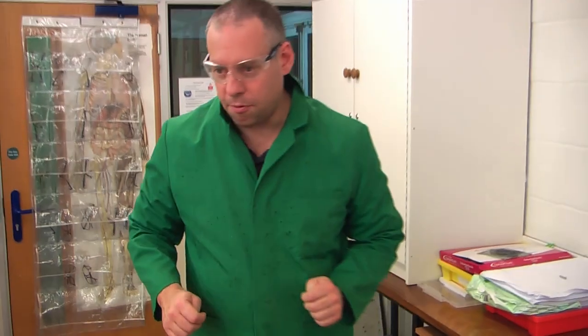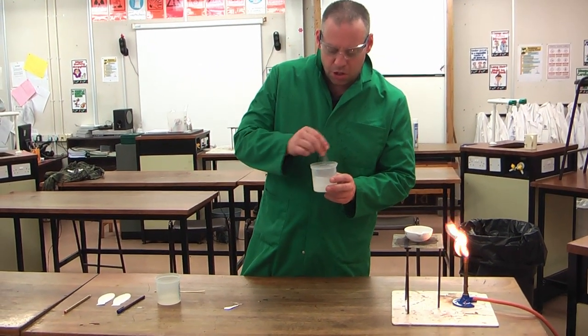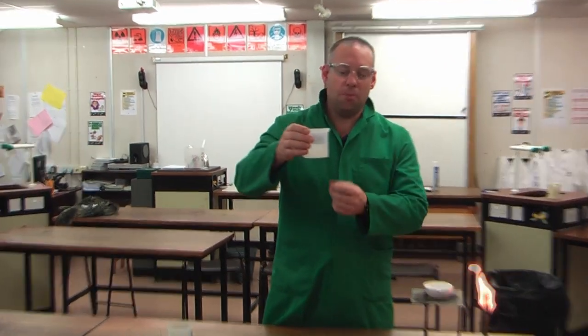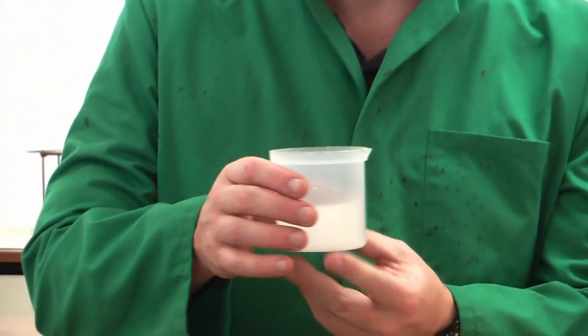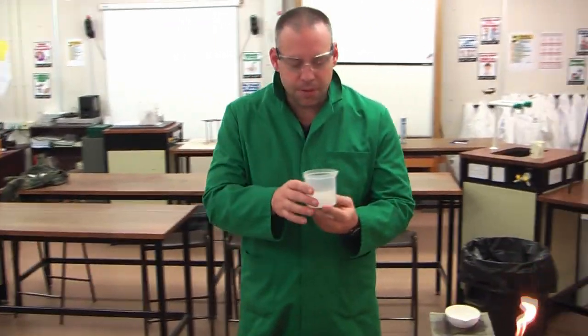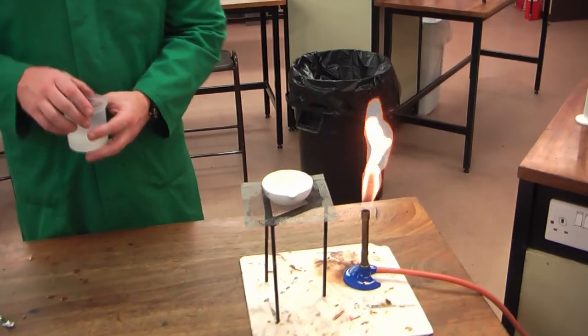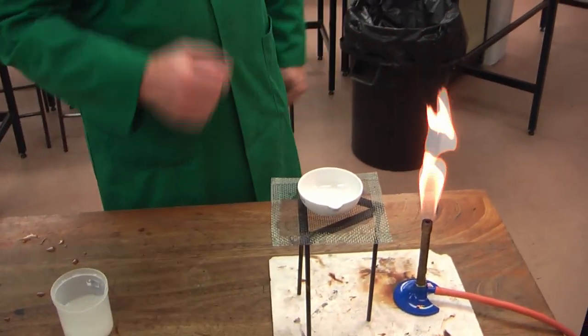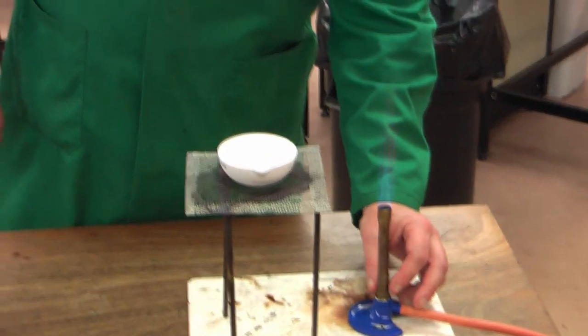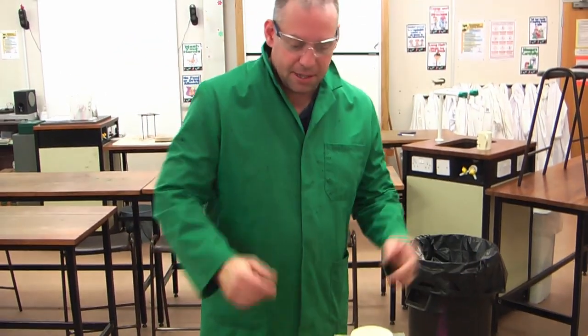So technique number four. And technique number five. Here I've got some salt and some water. So what do we do if we've got a solution of a solvent and a soluble solute? So in this case I want to separate these two. Now the technique you use is going to depend whether you want to get the water or the salt back. So this particular technique I'm aiming to get the salt back, not the water. So what I want to do is I want to make the water disappear.